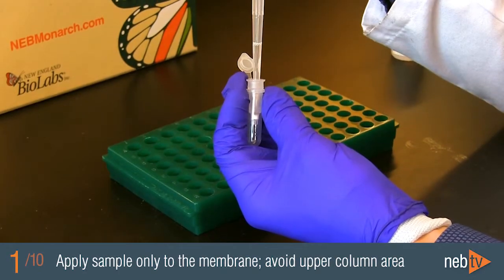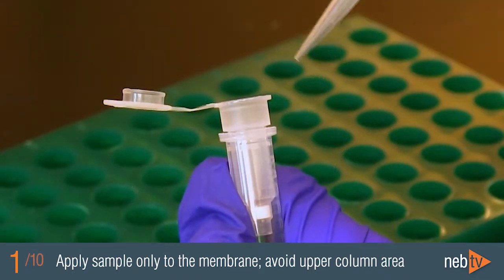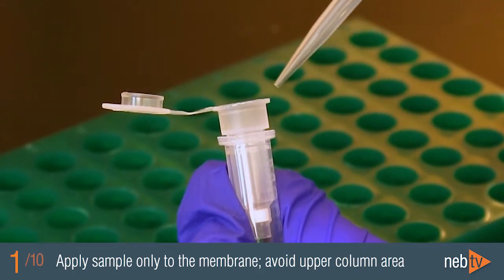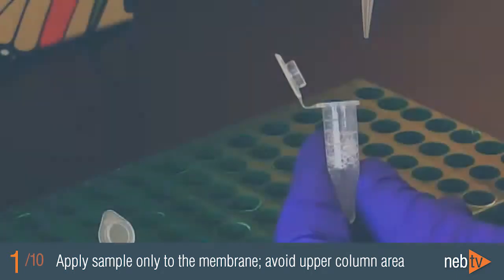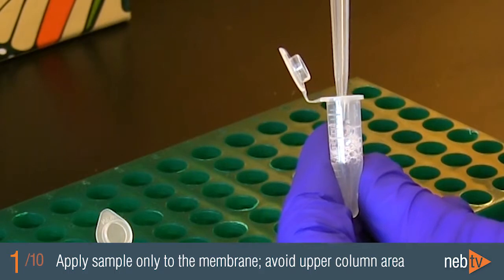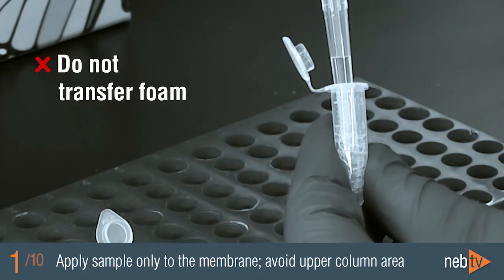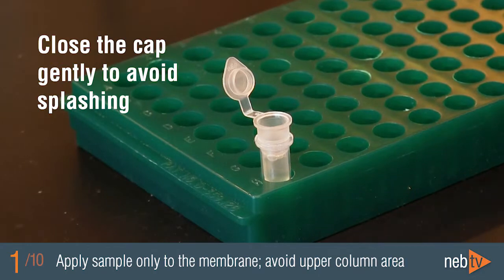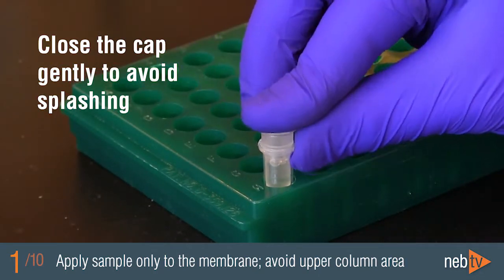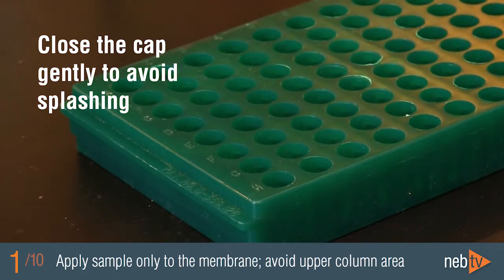When loading your sample onto the column, it's important to pipette it directly onto the membrane and avoid transferring buffer components to the upper area of the column, as these could later carry over into your eluate. Do not transfer any foam that may have formed during lysis. Avoid touching the column reservoir with your pipette when loading the sample. Close the cap gently and take care when moving the samples to and from the centrifuge to avoid splashing, which can transfer buffer components to the upper column area.